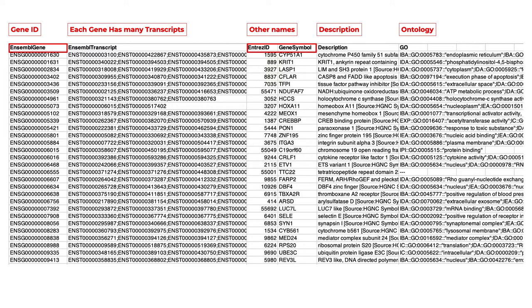A number of different strategies for naming genes have been proposed. The Ensembl ID includes the name of the organism with an identification number. The Entrez ID provides only a number. Each gene will have multiple transcripts typically annotated as ENST with a number for a human transcript.